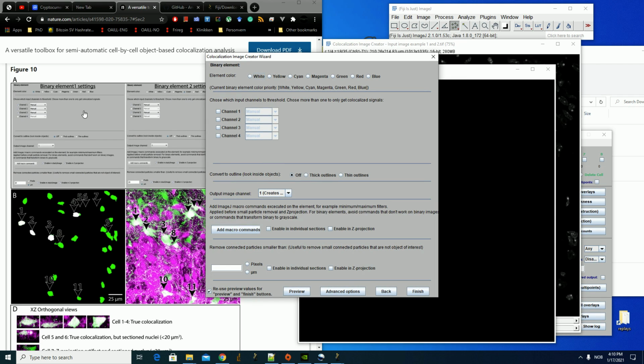So here it shows that we should look at the overlap between all these 3 input channels. We want to show that in white. So basically, what is the colocalization between all these 3 signals? Where do we see a signal that appears in the nucleus, and that is also positive for this label and also positive for this label? We want to see that in white.